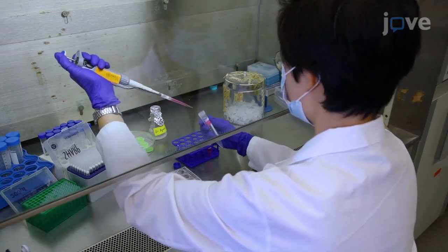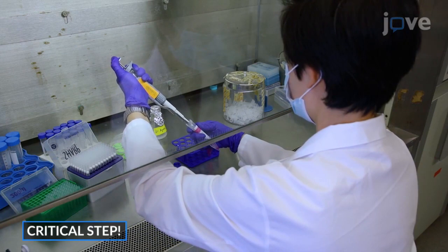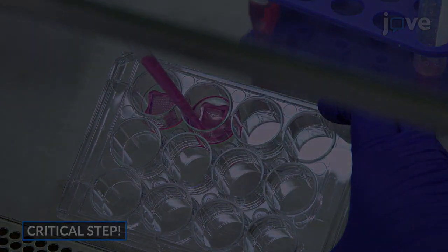To set up a T-cell co-culture, resuspend the appropriate number of T-cells in 190 microliters of an appropriate T-cell culture medium per well, and tilt the 12-well plate to allow removal of the cell culture medium.